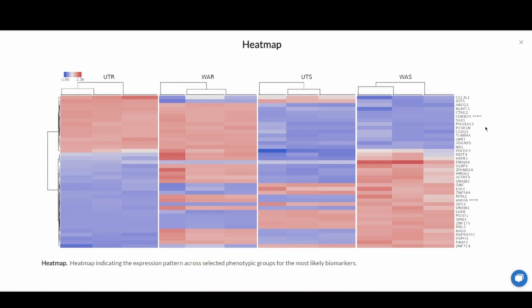It's split by phenotypic group, and here you can see highlighted by the platform using asterisks the two genes that were used to produce the decision tree.